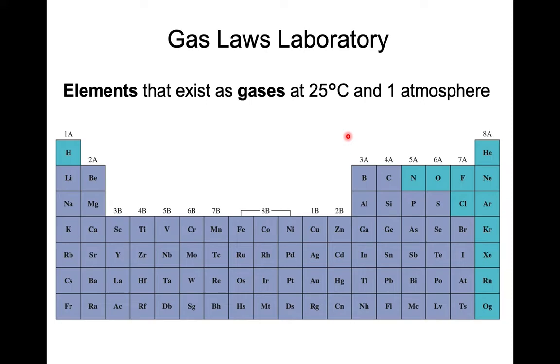Do the lab on gas laws in our laboratory. Here is a periodic table. I just want to mention this to start off with.